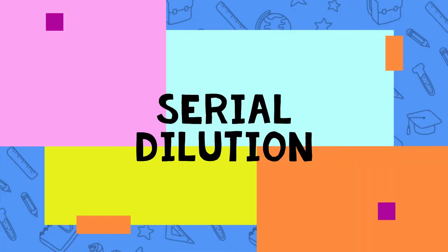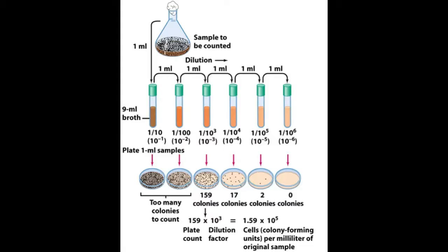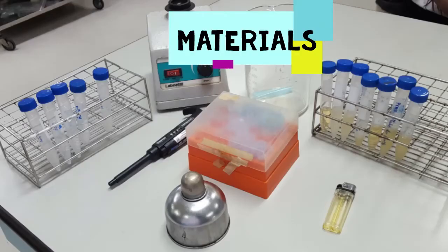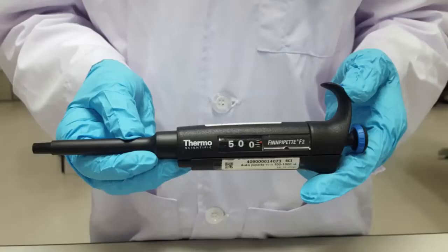Next, we'll be performing a serial dilution. We use this because most broth cultures will contain way too many microorganisms to count. If we dilute them serially, we can calculate how many colony-forming units are present within the broth culture. We will start with 7 test tubes labeled from 10 to the -1 to 10 to the -7. They will be filled with 4.5 milliliters of saline solution. We'll be using a micropipette set to 500 microliters to transfer our cultures to these tubes.